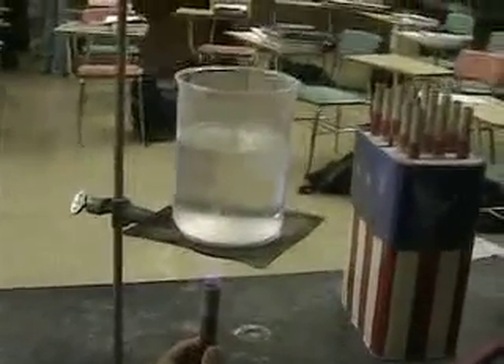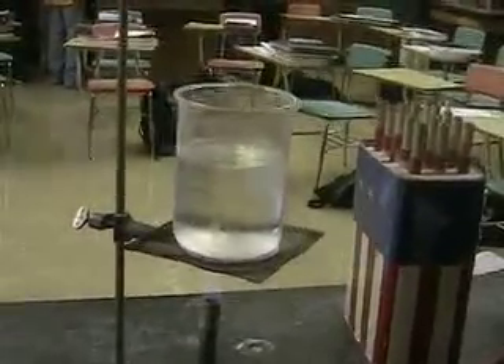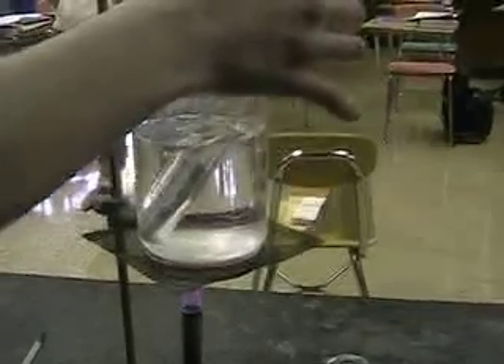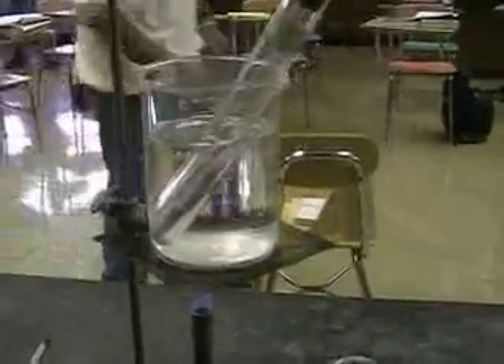We want to start with this metal hot, so we set up a beaker of water, which we're going to start boiling, to heat up the metal. We put the metal into the water bath and let the water boil. Leave the metal in there until the metal reaches the same temperature as the water.